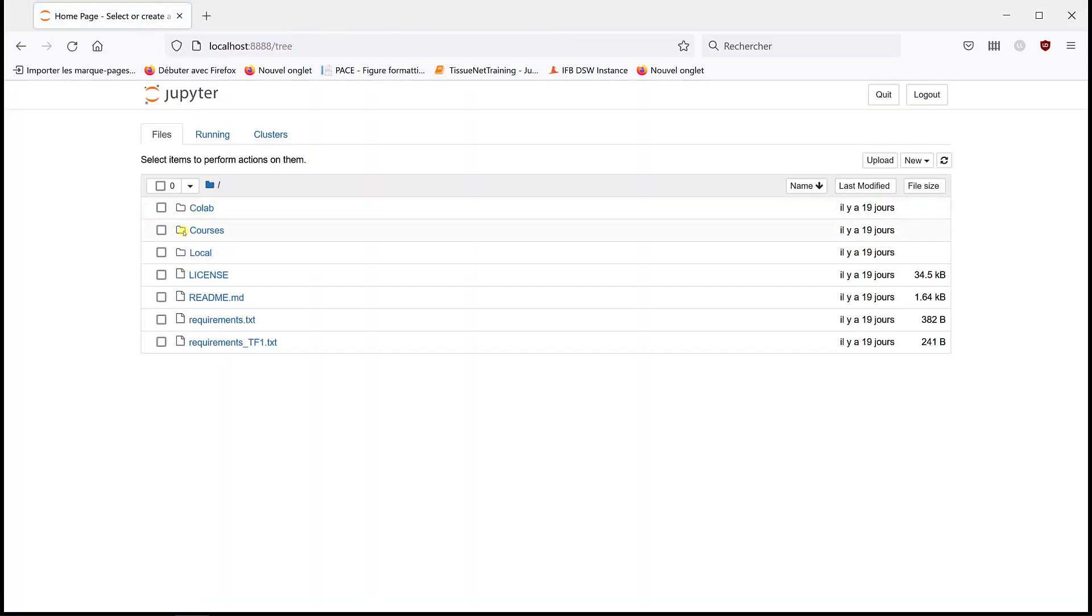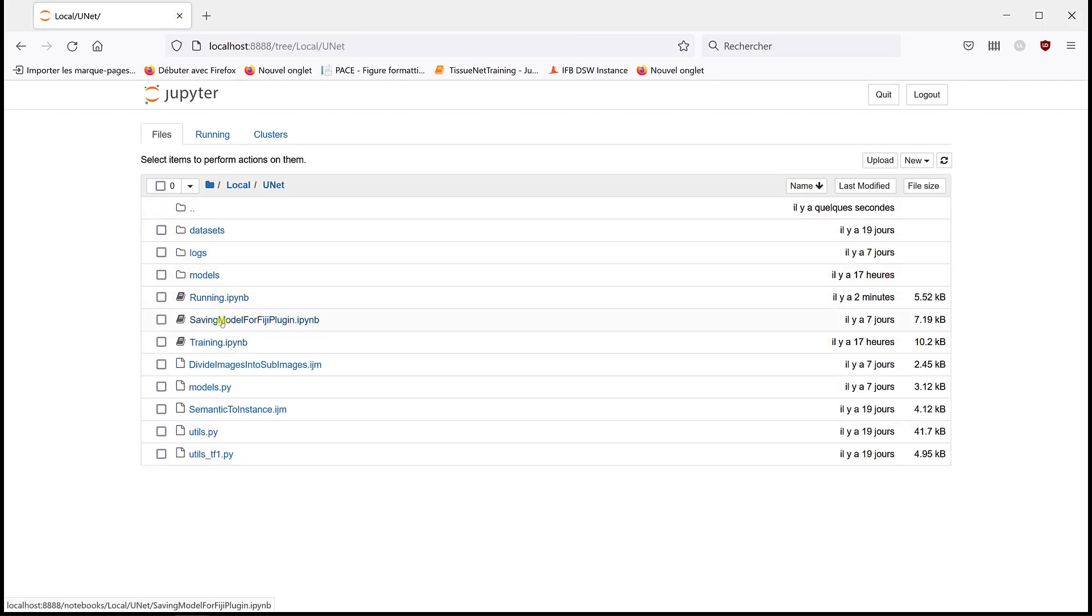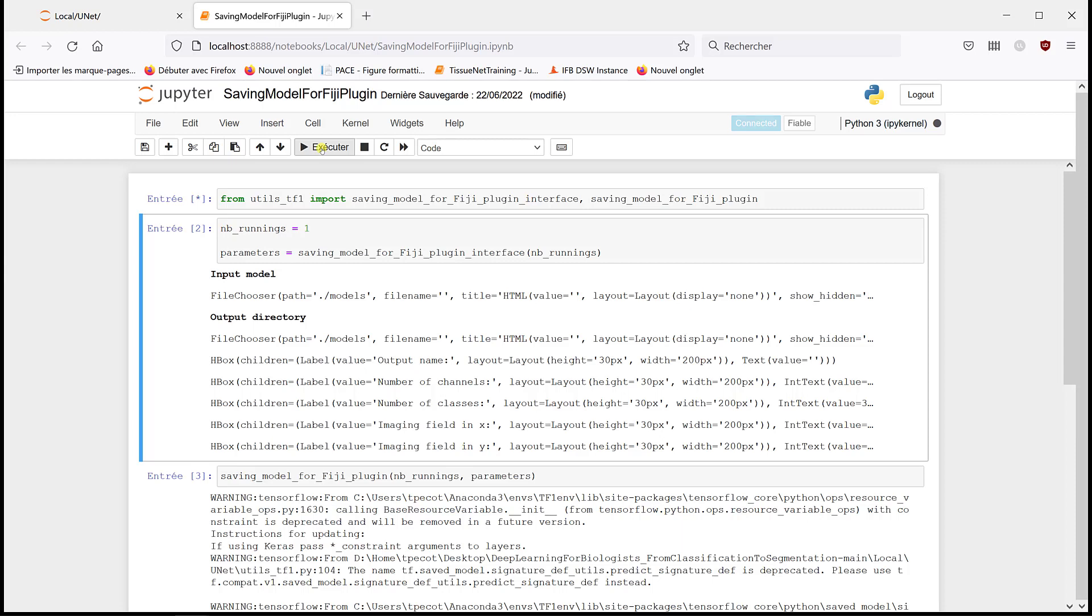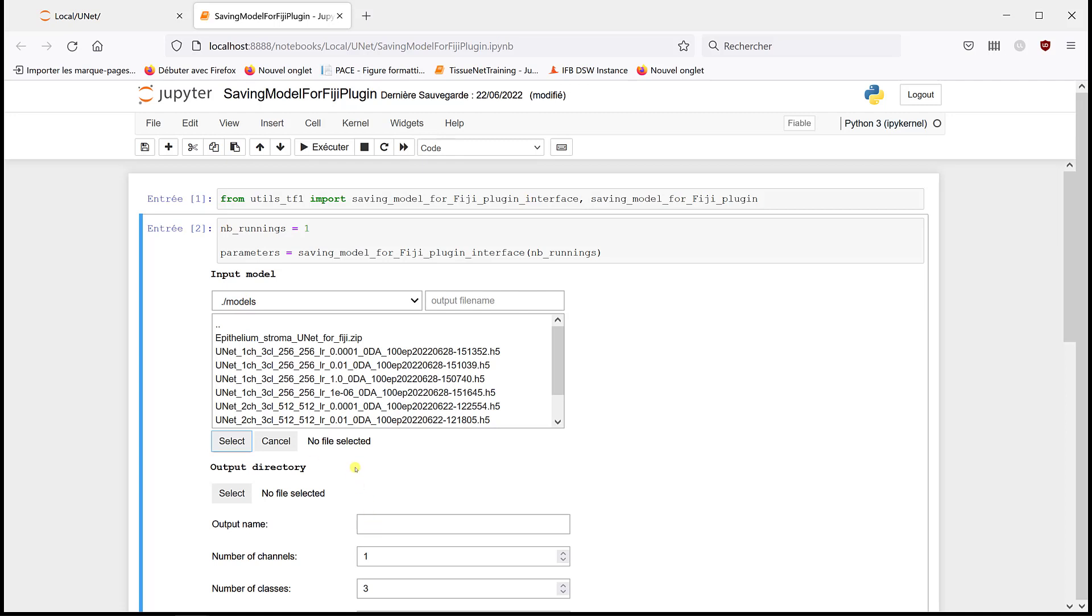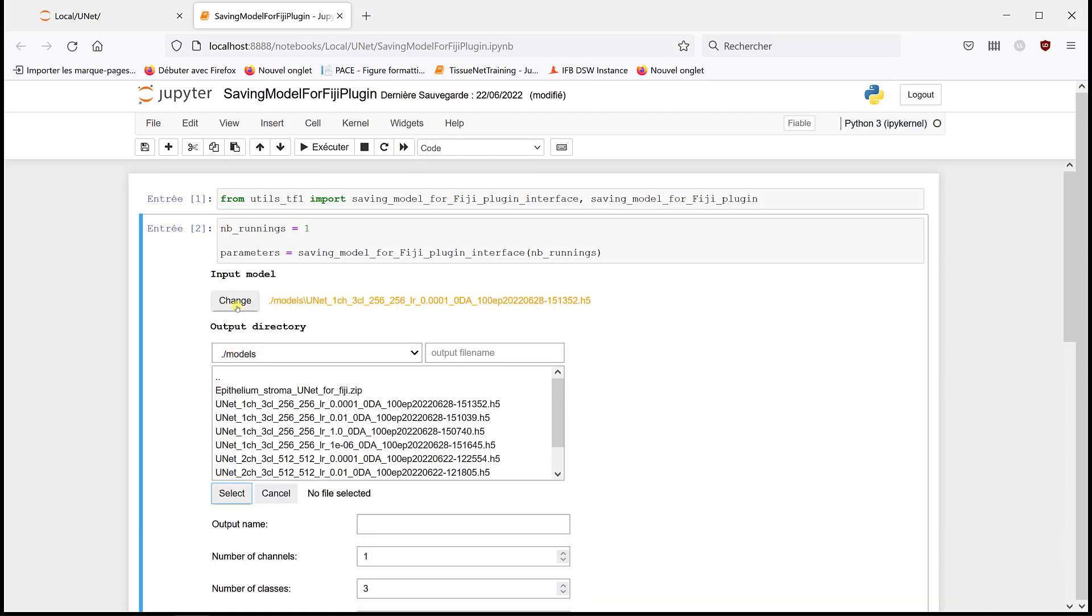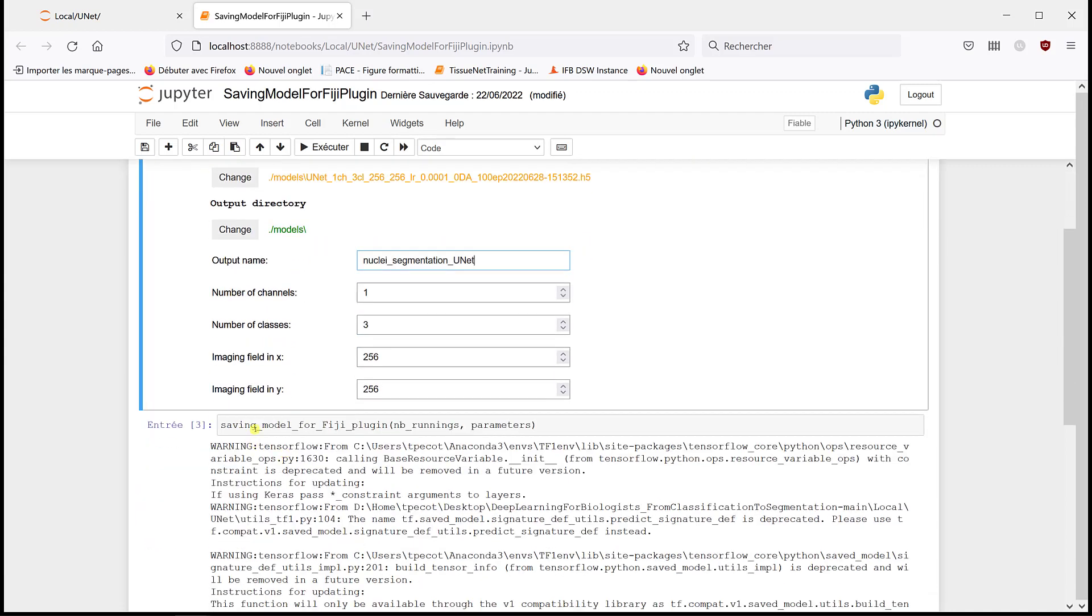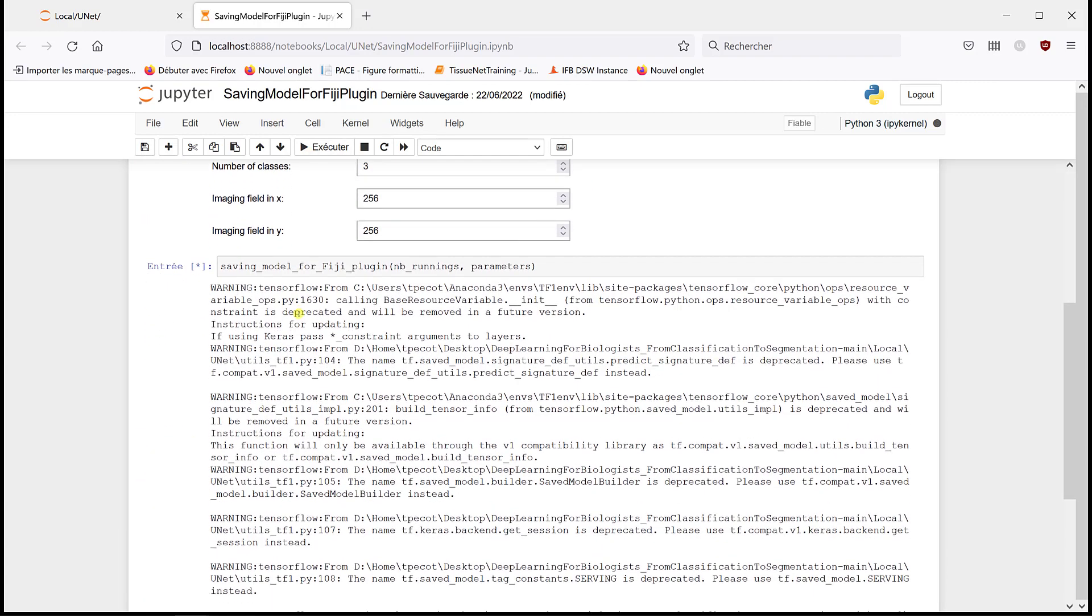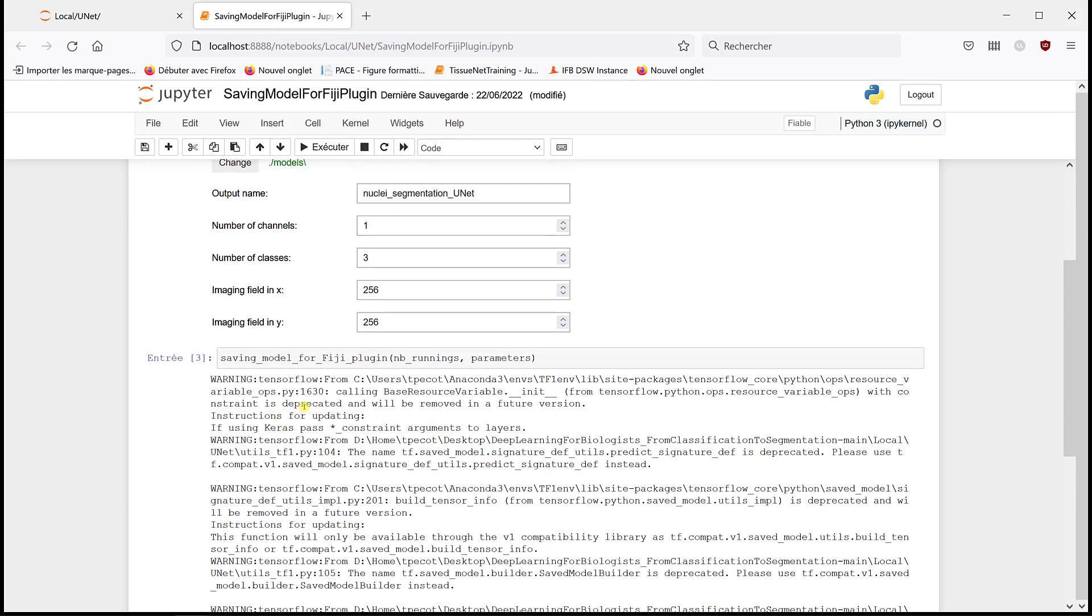And if you didn't create this one, you can go back to the previous video where I show how to do it. And I have both of them in the notebook again, which I put in notebook. So I can close this one. I'm going to go in local U-Net. And there's this notebook we already use, which is called saving model for Fiji plugin. So I'm going to run it. So it's still the same, codes, now parameters. The model I want to save is the one I just used, which is the one with e-4. The output directory, I'm going to put it in the same output. And I'm going to call it nuclei segmentation U-Net, for example. We have one channel, three classes, 256 by 256. I'm going to save it.